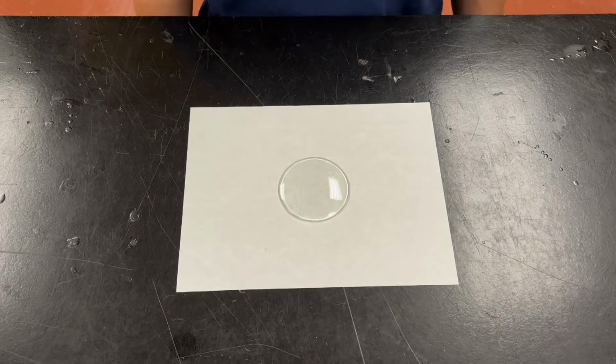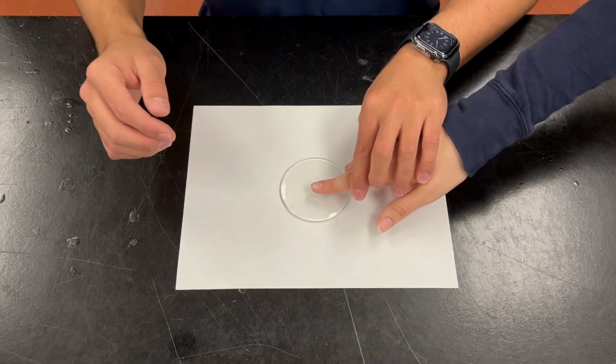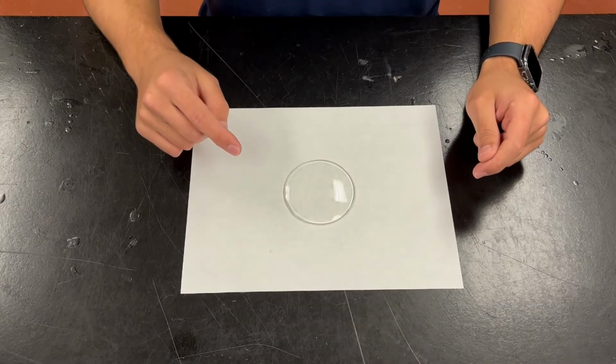Can you finally do it? Okay, I'm going. Just give me your finger, kind of essential. Just do a gentle tap. Remember, you don't want to aggressively tap your finger. That might leave unclear or partial fingerprints.